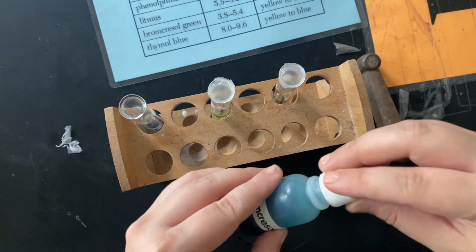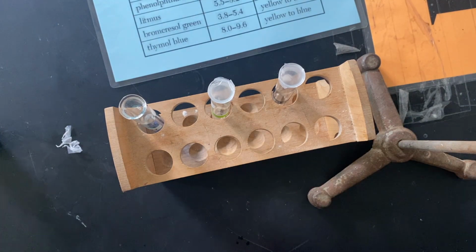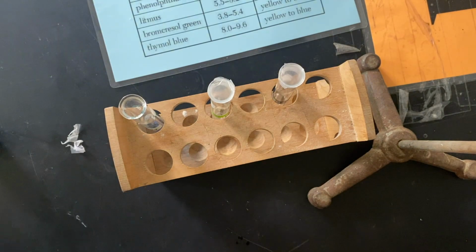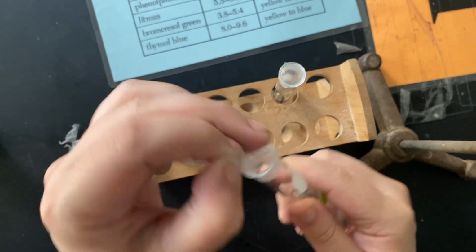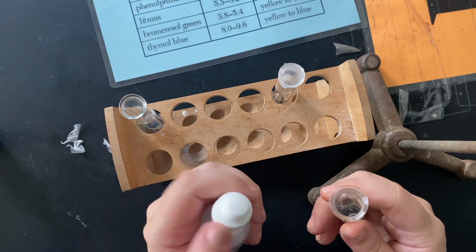So once you're done with the indicator, put the cap on. This will stain your clothes, so be careful. Potion number 2 uses phenolphthalein. So same thing, potion number 2, make sure it says that. Take off the parafilm, phenolphthalein.